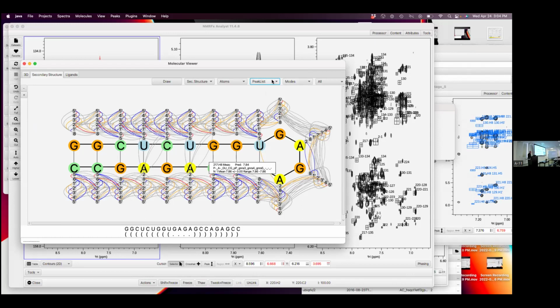When you click here, this is the proton prediction. And if I change the mode to show carbon predictions, now if I click on an atom, I'm getting the carbon prediction for that atom. You can see there are 0 examples of a G preceded by a purine and a C and followed by a U and a G in the database, but I do a prediction using support vector regression machine learning. Why does it show the MNO?